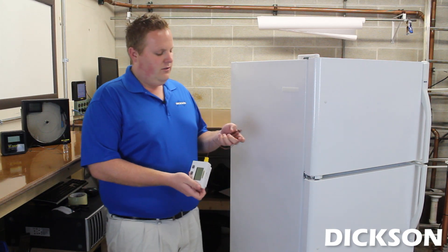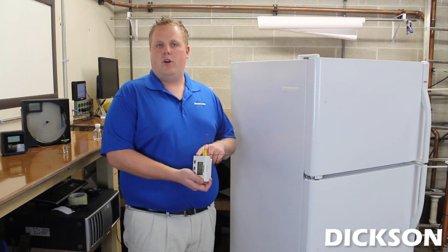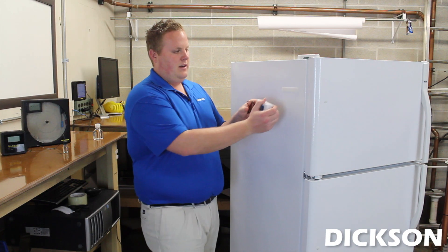The first product I'd like to show you is our SM320. This unit has a K-type thermocouple probe that will read the inside temperature of this freezer. We also make a unit with two probes that will read the freezer and the refrigerator on two separate channels.